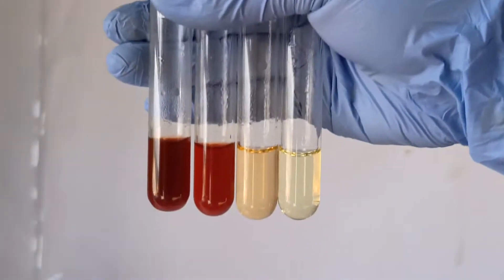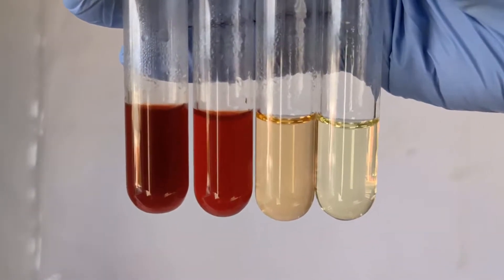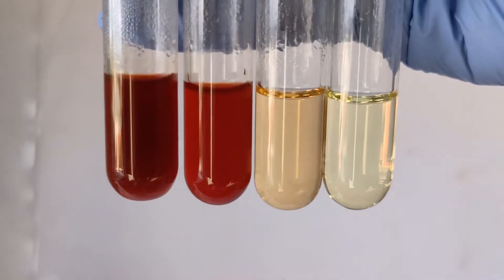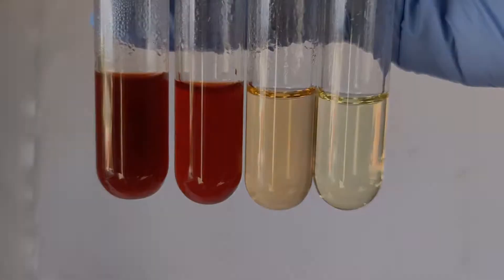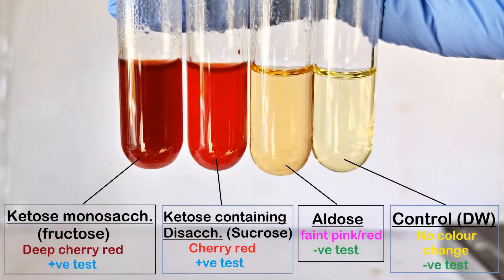The control tube, as expected, shows no significant change in the color of its contents and only retains the original reagent color, which is a faint yellow. This is all about the Seliwanoff's test for ketose sugars.